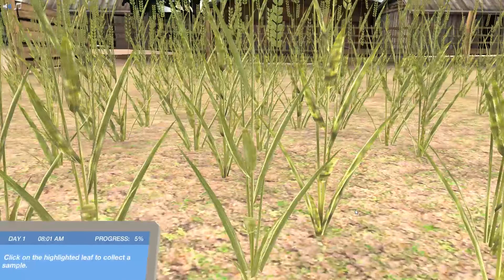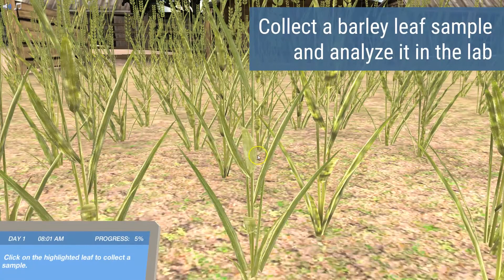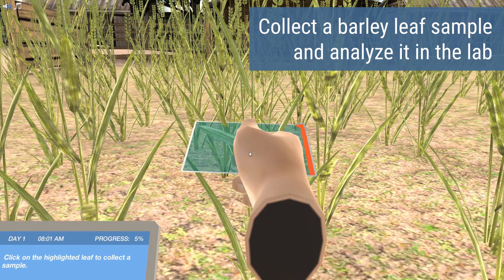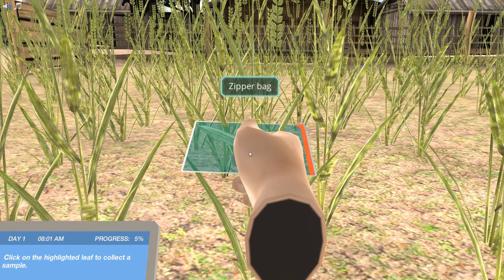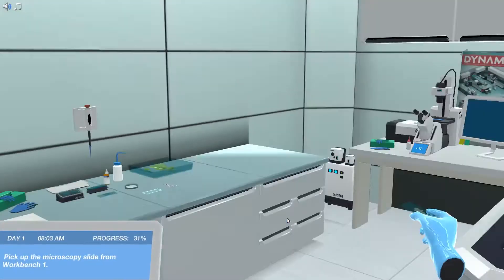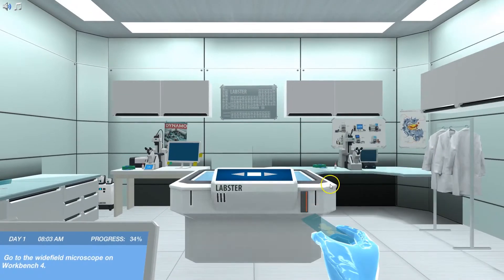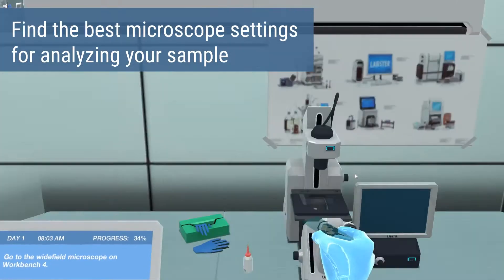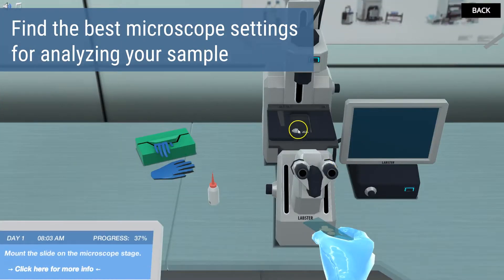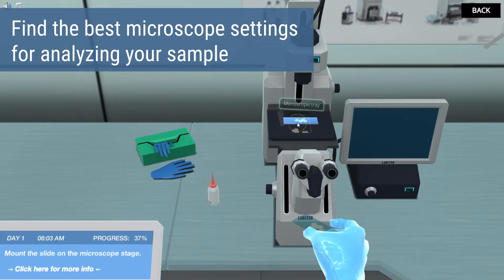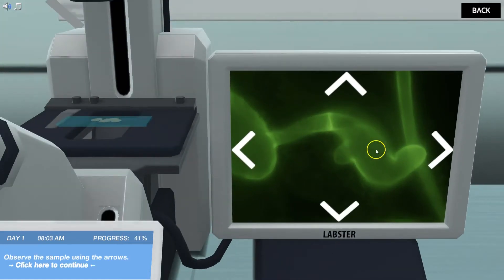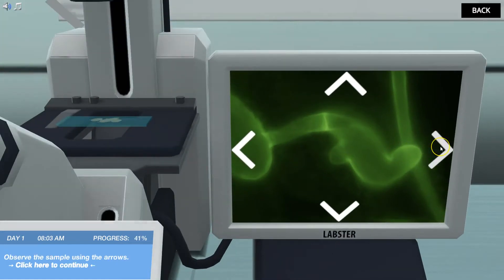At the beginning of the simulation, you are asked to take a sample of your uncle's infected crop to analyze it in the lab. Your task is then to choose the optimal microscopy settings to take the best possible fluorescence images of the stained crop sample.